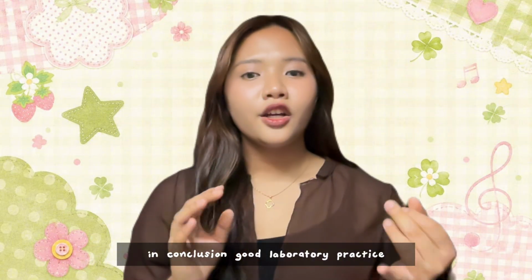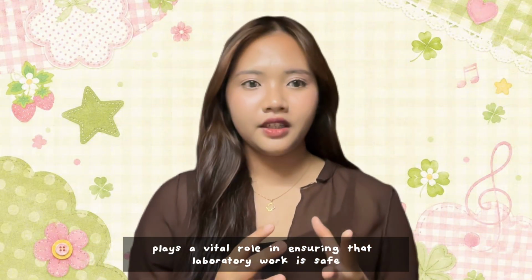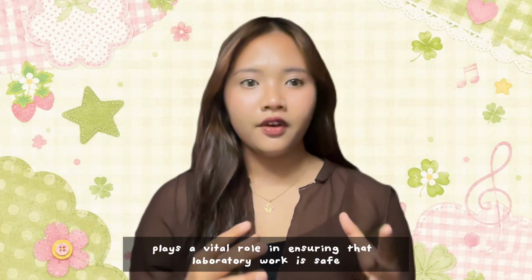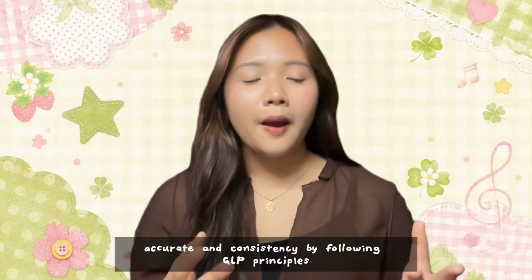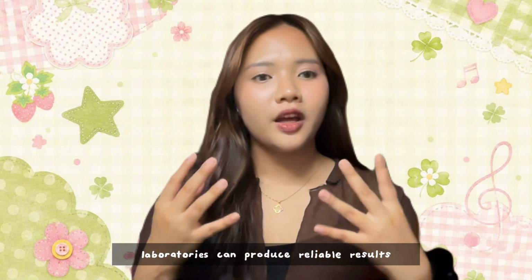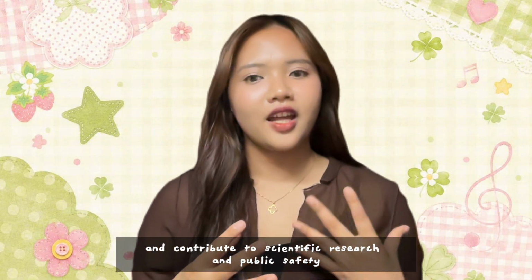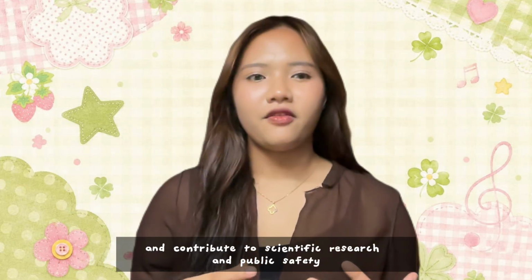In conclusion, good laboratory practice plays a vital role in ensuring that laboratory work is safe, accurate, and consistent. By following GLP principles, laboratories can produce reliable results, maintain high-quality standards, and contribute to scientific research and public safety.